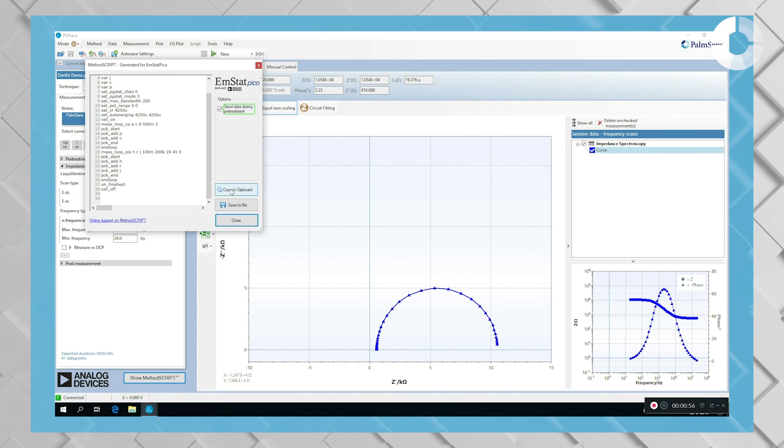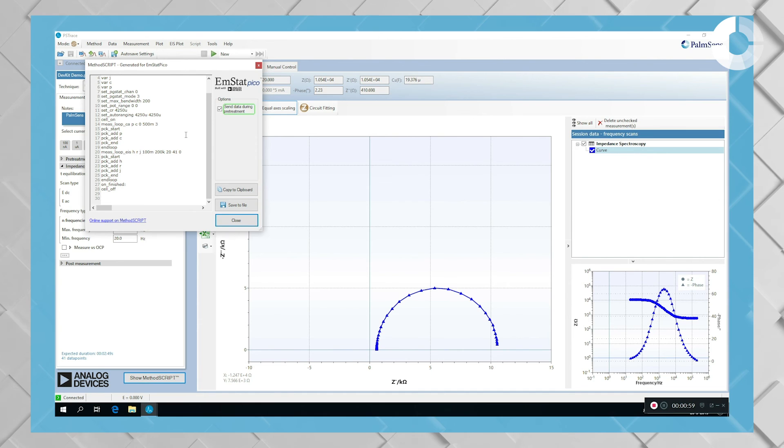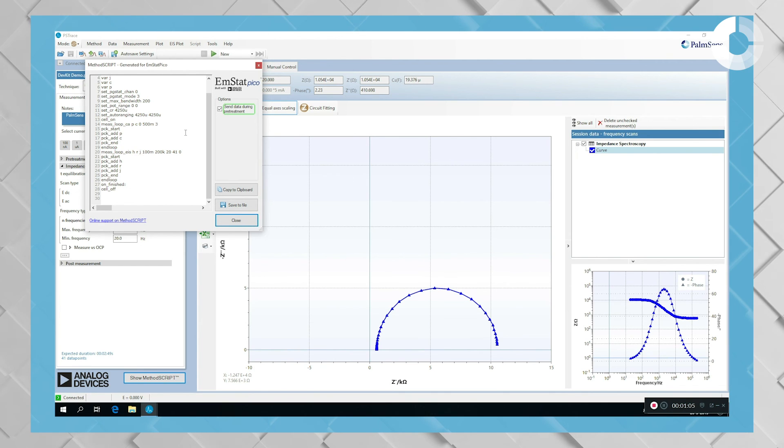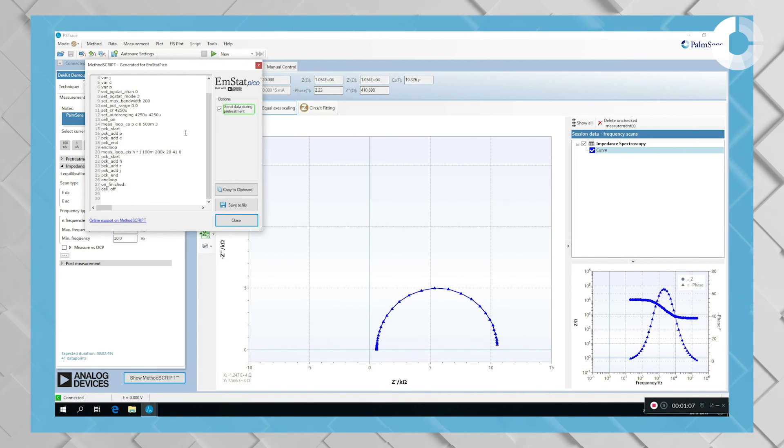And when you copy it to the clipboard and use the snippet in your own software for your embedded project, you can easily reproduce exactly the same measurement that you have done here today with PS Trace.